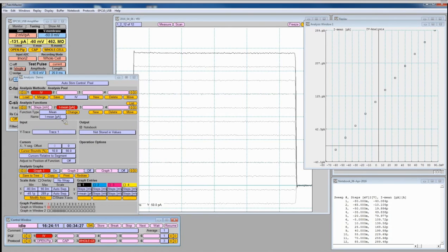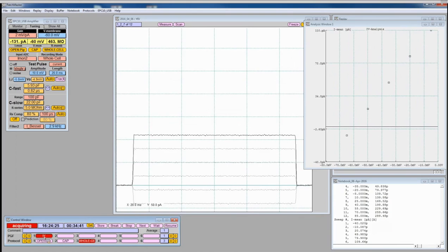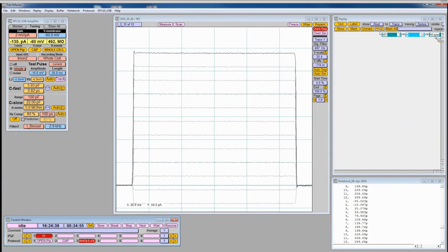And if you now go, for example, over here in the online analysis window, you're selecting steps, and you decide I don't need the notebook, you can unhook it. When you close it, these changes will be enabled. And if you now run this whole thing again, you see, now the steps are gone. The analysis is still being performed completely like before, but the steps are not being recorded anymore in the notebook. So these are the things that you can, for example, do back and forth.